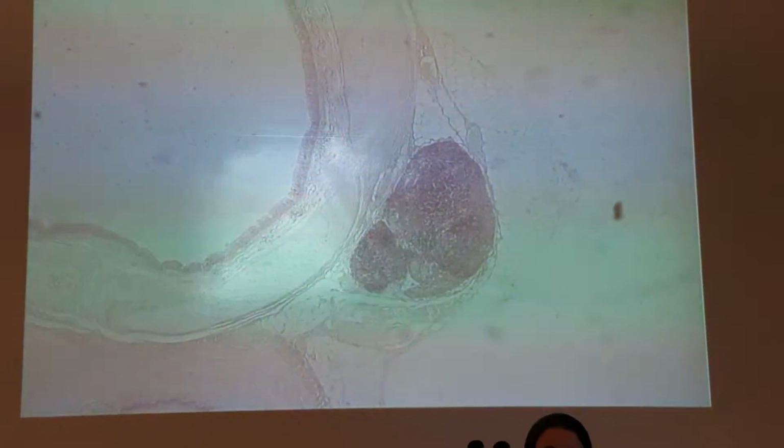Okay, now the issue with this one, if you notice the hyaline cartilage doesn't make a complete circle there, so it's a little odd. But we got the PSCCE, the lamina propria, the hyaline cartilage, the trachealis muscle, and then let me move it down. And then to the outside, again, the hyaline cartilage, the outside is where we're going to ask about that perichondrium. What's this? Adipose.